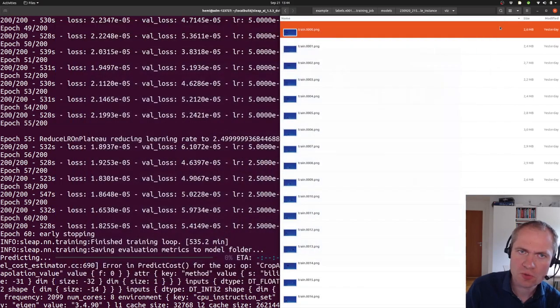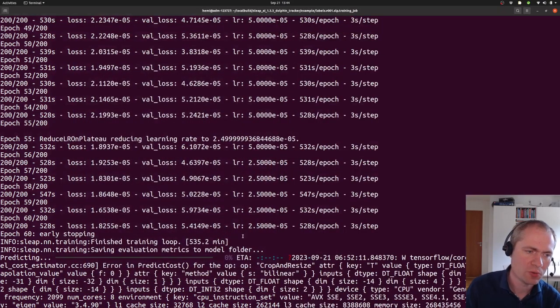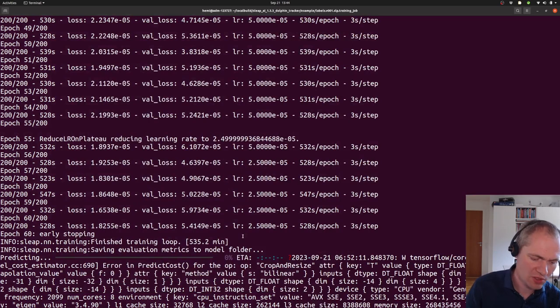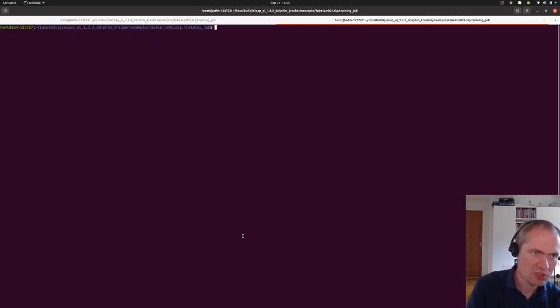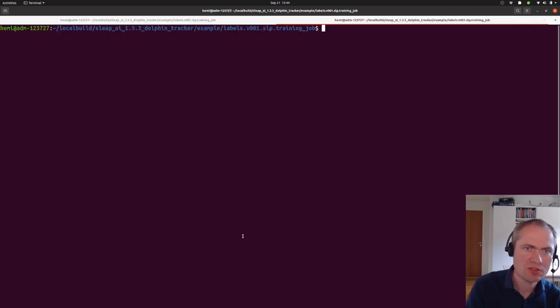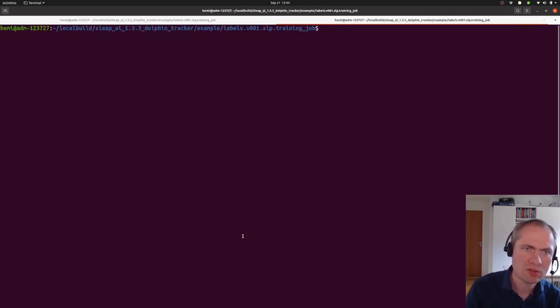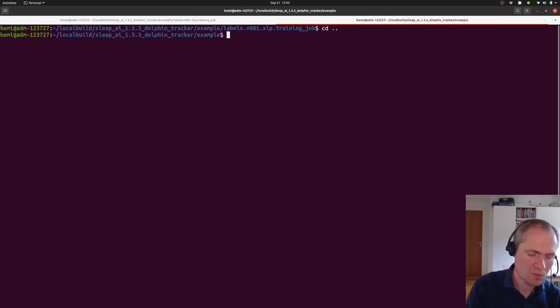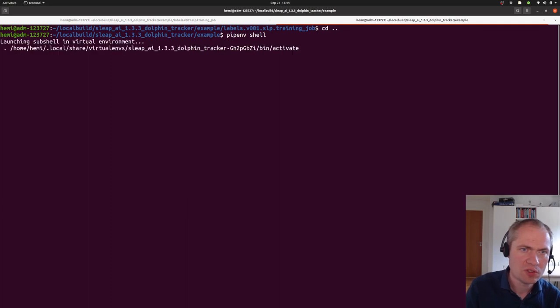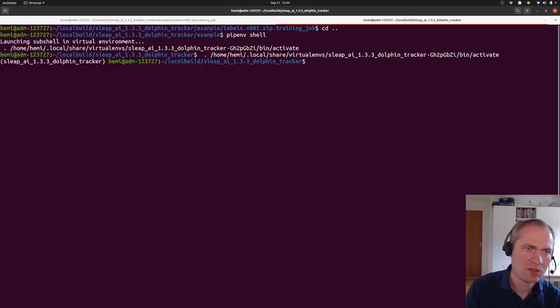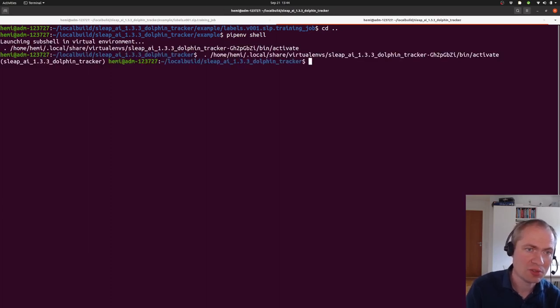So this was what we had when we trained the model. So let's see if we can actually take a different video, and then see if we can analyze or actually track it in all its locations here.